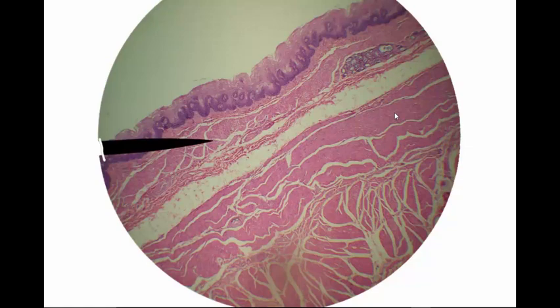There's a layer where the fibers of the smooth muscle cells are running the length of the tube in a longitudinal fashion. And then there's another layer where the smooth muscle fibers are in a circular arrangement so they're wrapped around the tube. Those fibers are important for peristaltic contractions for example. And that is human esophagus.